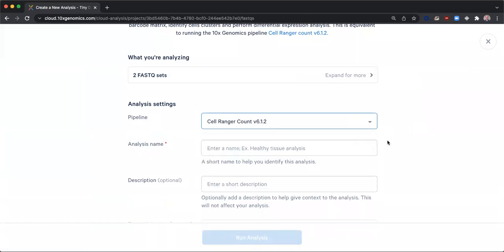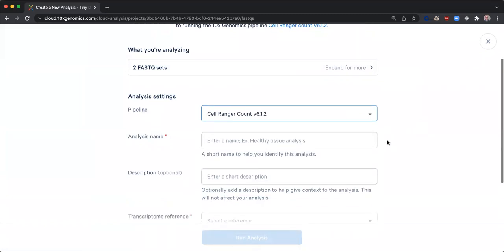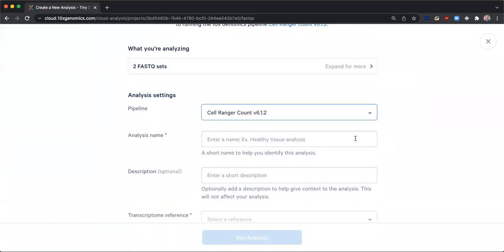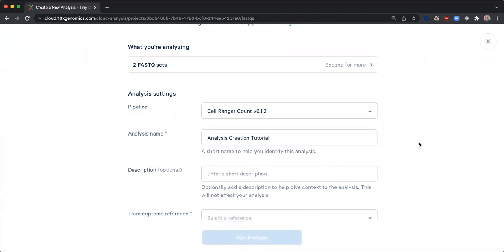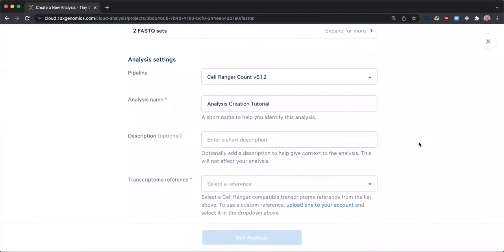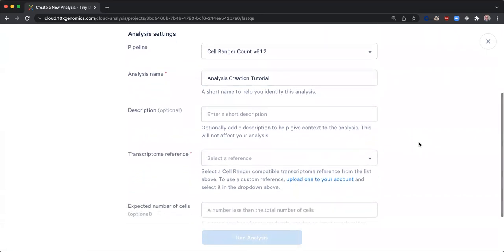We must enter a name for our analysis and can optionally add a short description. Having entered a name, we must also select a transcriptome reference from the drop-down list.